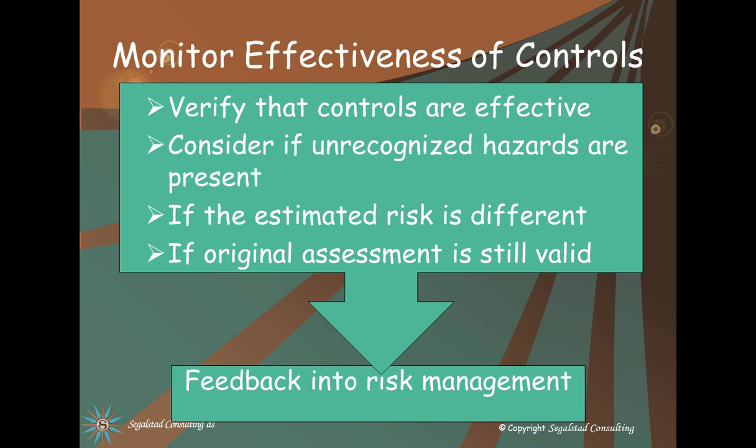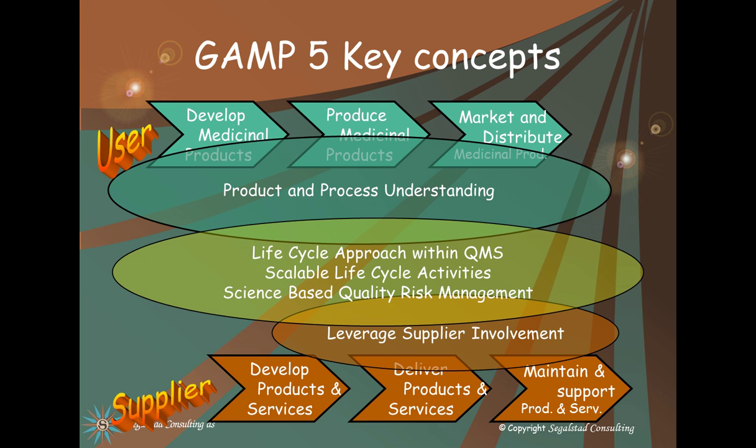When controls have been added, the risks should be less than they were before the controls. But we need to reassess the risks to show the current state and document that. And the assessment should, of course, feed back into the risk management in order to effectively manage the risks.